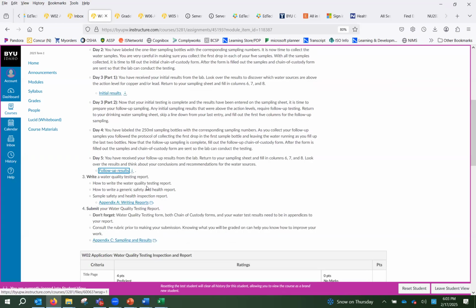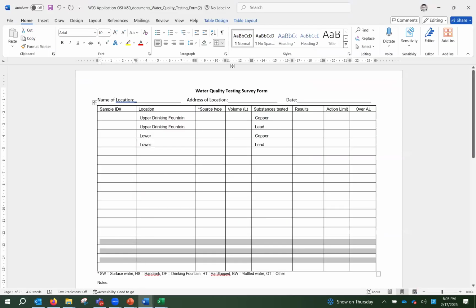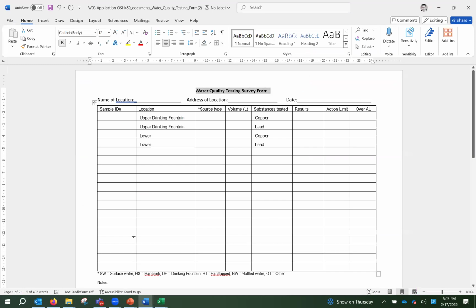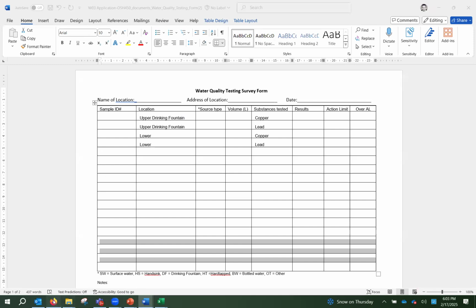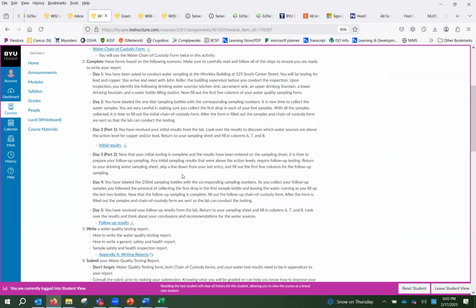here, let me close this. And then you're going to put them over here on your survey testing form. Those are going to go down here. Okay. And so then we're pretty much done with that portion of the sampling.